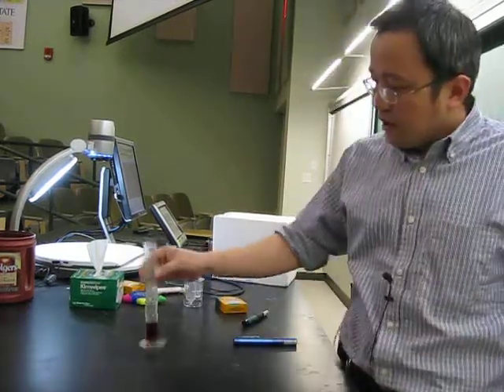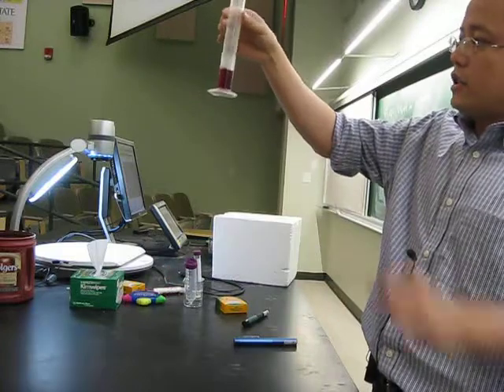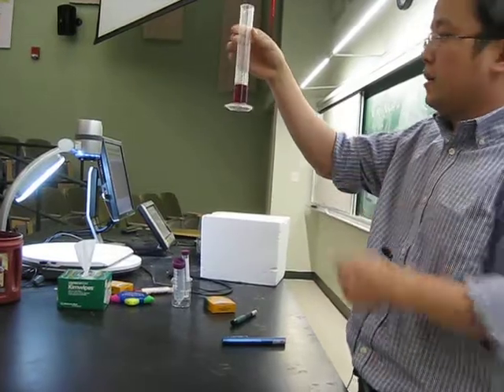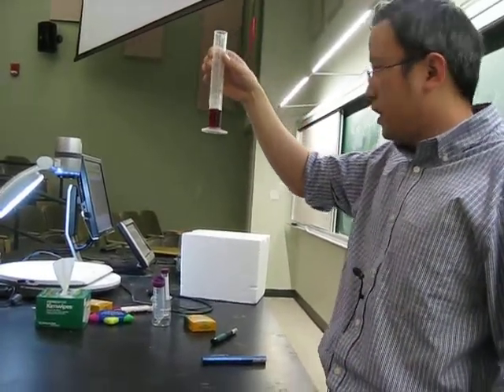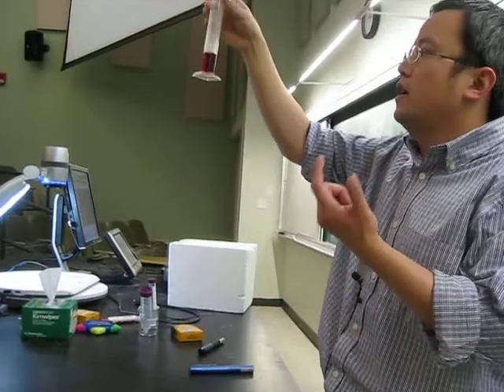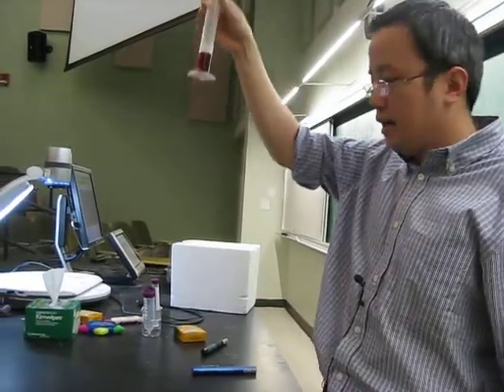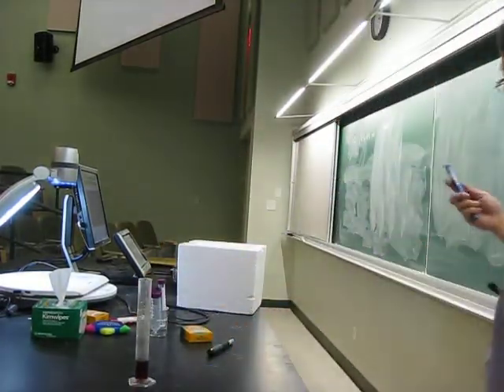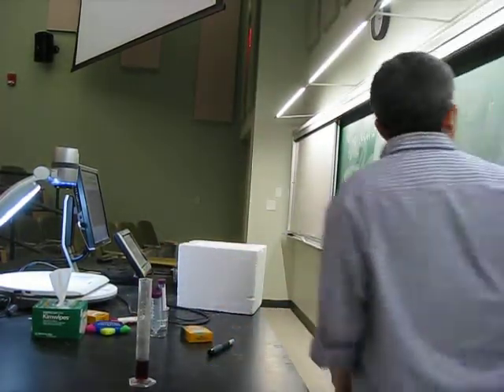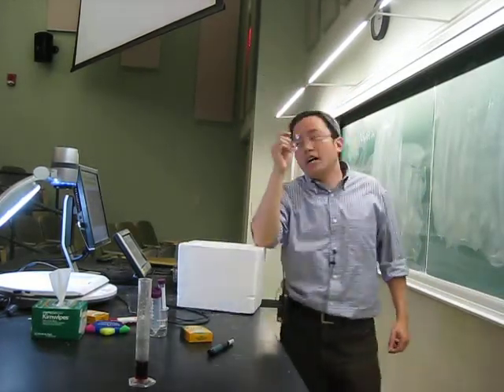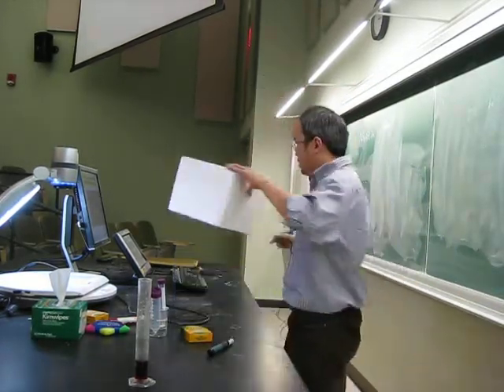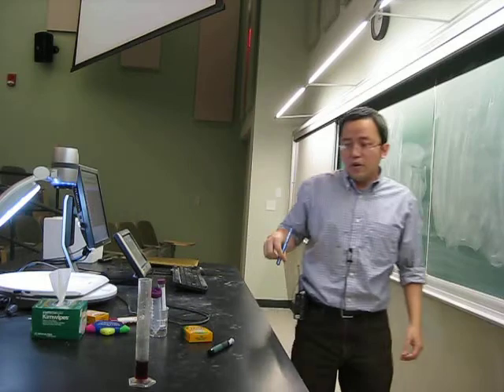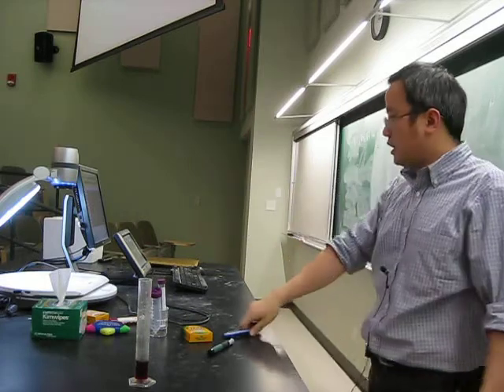Okay, so let me repeat just briefly. First, I put in 10 ml of ammonium hydroxide, and then after that I put in 2 ml of phenolphthalein. You see the color change from colorless to red, right? That is expected because in the first case, ammonium hydroxide, that pH is basic. It's about 10, so around 10, I should say. Okay, and then you get a red color. Okay, so that's step one.